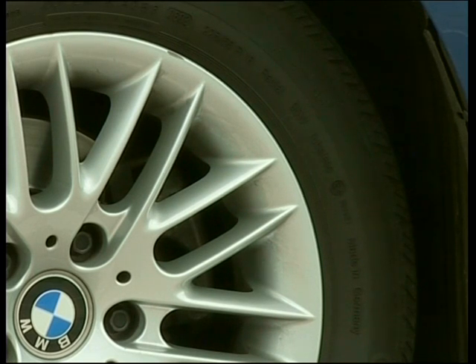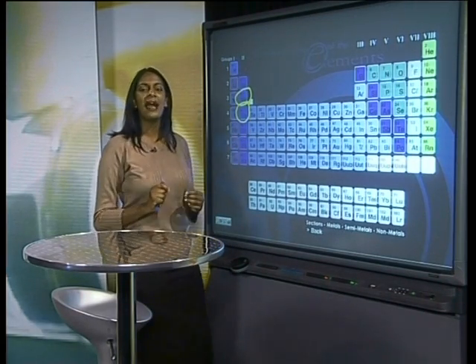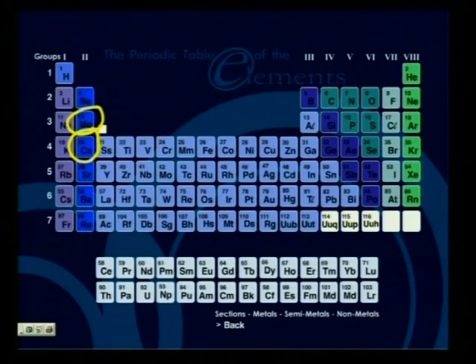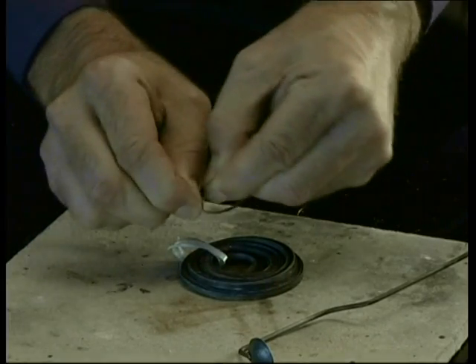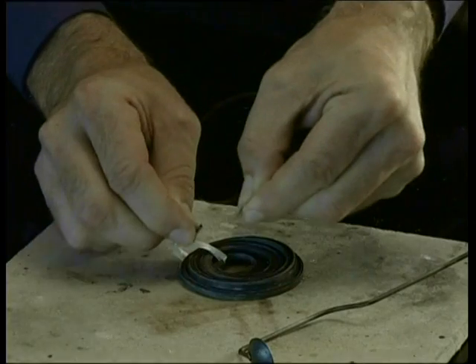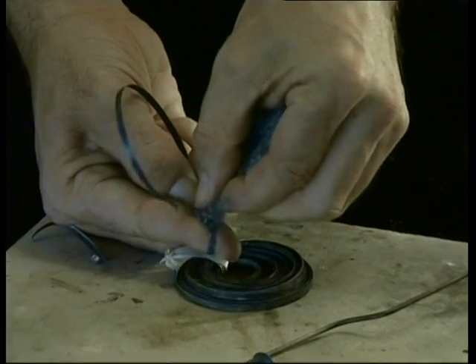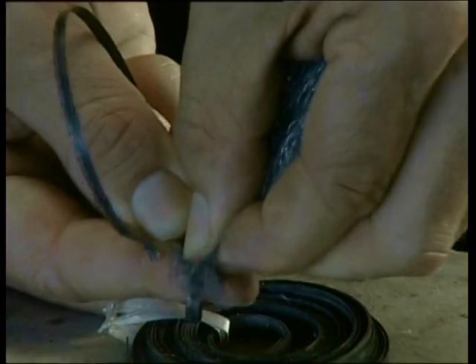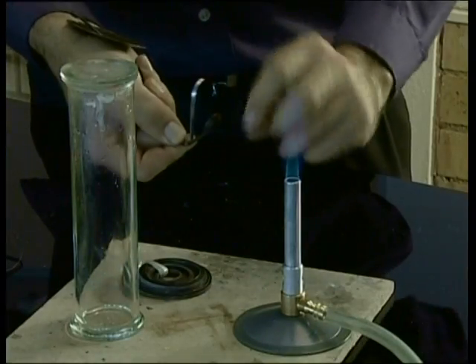The closest thing to a pure form of magnesium we have seen is the mag wheels found in cars. These mag wheels are produced from a magnesium alloy, a mixture of metals with magnesium as the main ingredient. We have chosen to do experiments with magnesium and calcium to show how alkaline earth metals react. Magnesium is a light grey colour and it is shiny. It is usually found in thin strips in a laboratory. If magnesium is exposed to air for too long, it forms a dull grey outer layer that has to be sandpapered off.